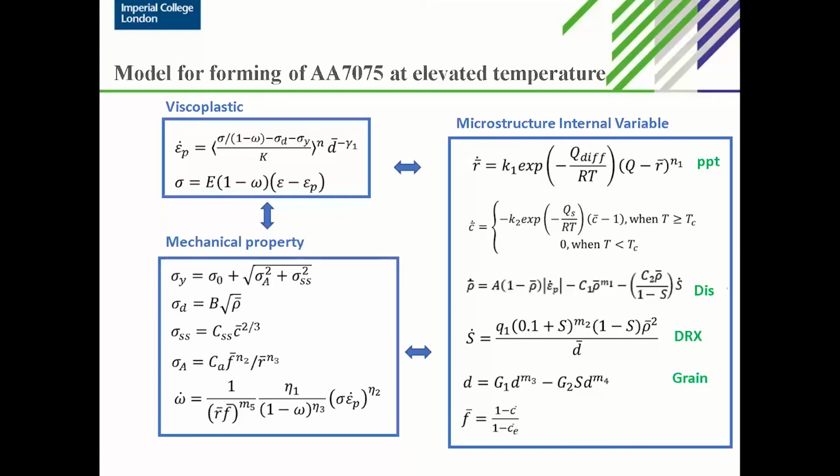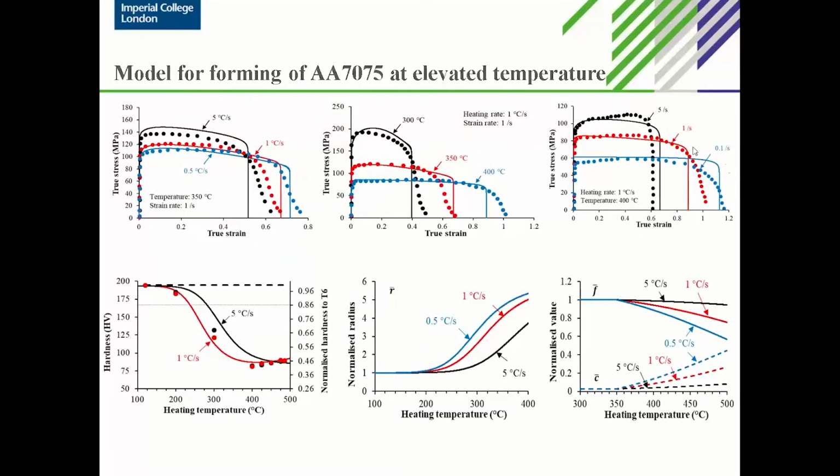So based on such a set of microstructure-based constitutive equations, it has been calibrated and is able to describe the stress-strain curves, the hardness evolution, and the microstructure evolutions as well.